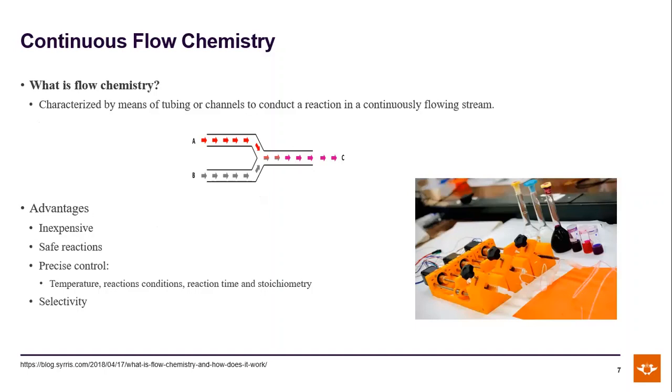The syringe pump system shown here on the screen, which is controlled by a computer and is connected to the manufactured microfluidic device, was also 3D printed. The parameters, such as temperature and stoichiometry, can be precisely controlled in this system, thus it makes it sustainable.